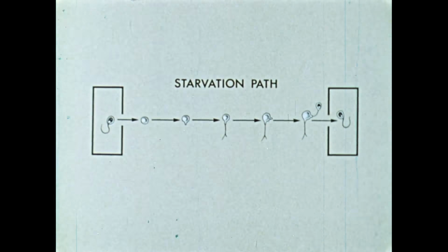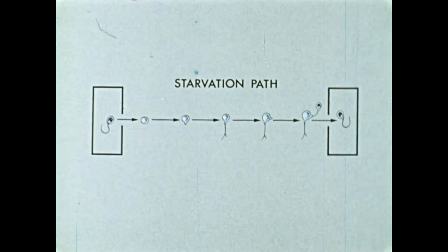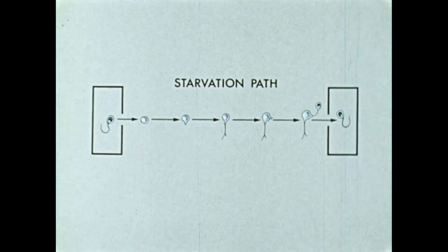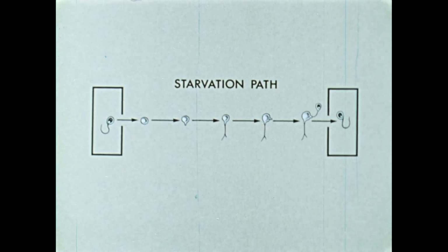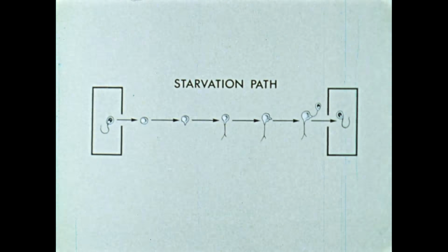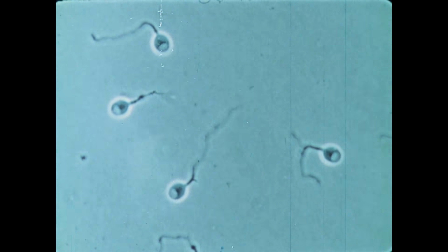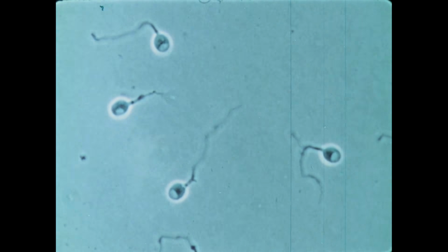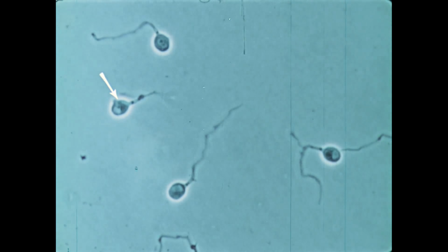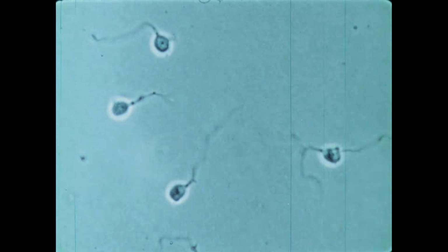If a germinating spore is partially deprived of nutrients shortly after encystment, it stops growing. The plantlet then functions as a very small sporangium and produces but a single zoospore. Here are some of these small plantlets which are barely larger than a spore. Note the abnormally tiny papilla through which the much larger zoospore must squeeze to escape.